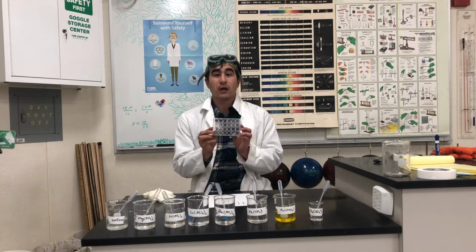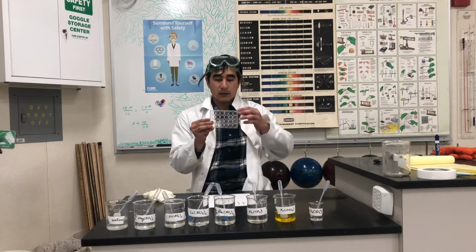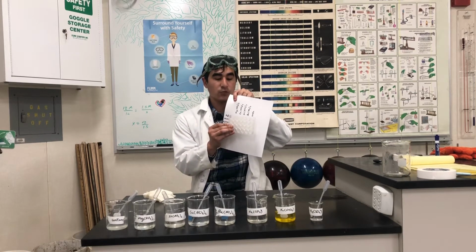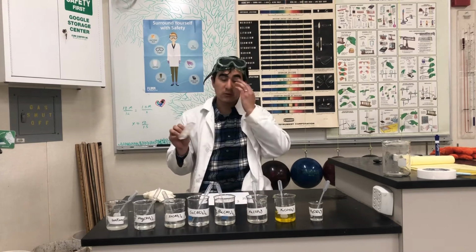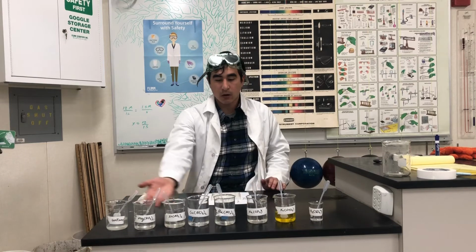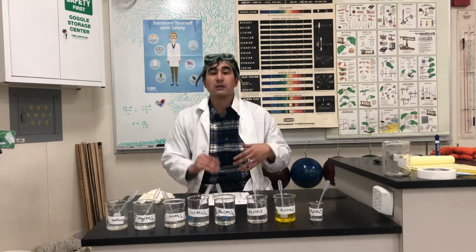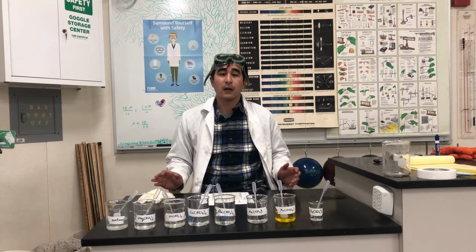And in the shot, you are going to see this little well tray that I have, and I have the chemicals on it, so that way you'll see which aqueous solutions I am going to be mixing together. Now, here are all my chemicals. I will say the names of each of them. You will need to determine which ones they are.